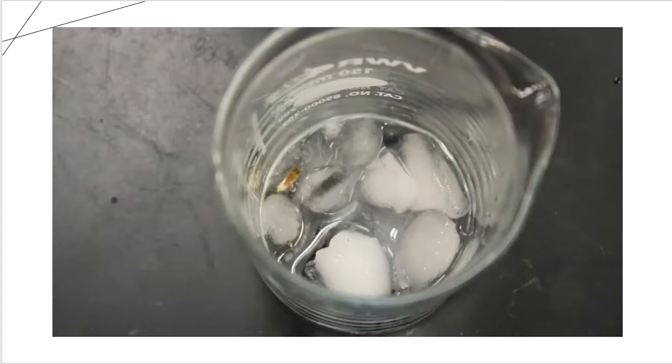All right, before I start this video, I just want to go back and tell you that the reflux stopped at 12:52 p.m. That is when I took it off of the reflux apparatus, and we are getting ready to go to the next step, which is pouring it over cracked ice, and what looks like a bug inside of the cracked ice. That looks kind of weird and strange, doesn't it?